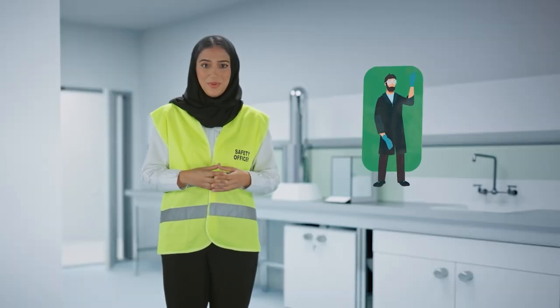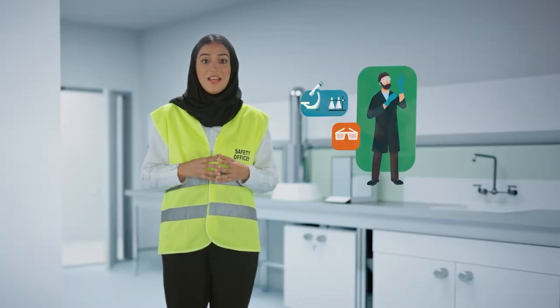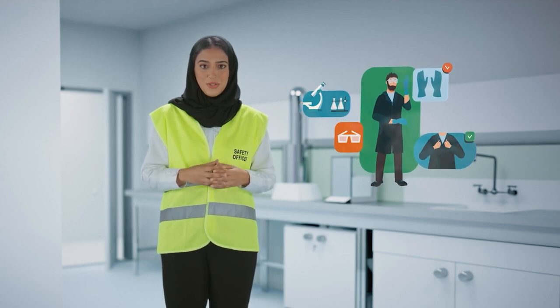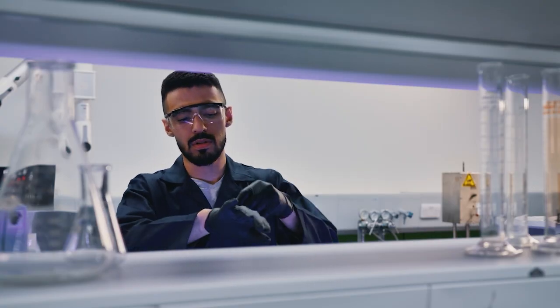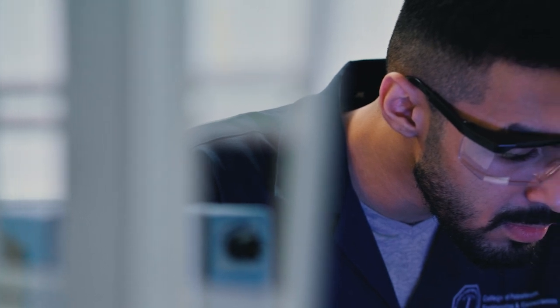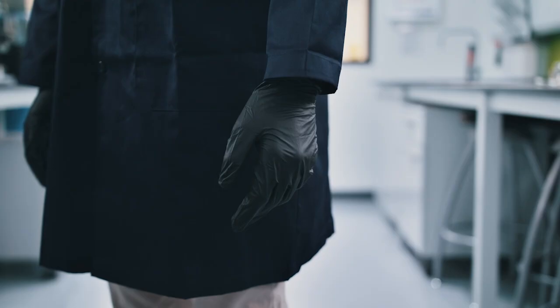Personal protective equipment, commonly known as PPE, is one of the principal ways of protecting you from harm when you work in the laboratory. You must comprehend why your instructor requires you to use PPE. PPE includes items designed to protect specific areas of your body, such as your eyes and hands. The equipment commonly includes gloves, eye protection, and laboratory coats.